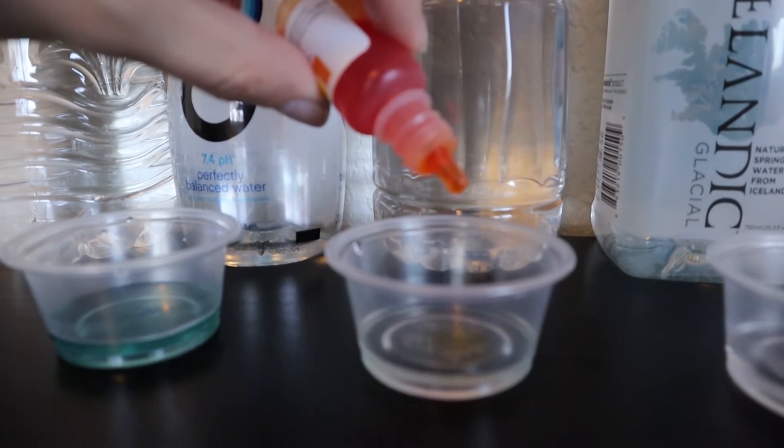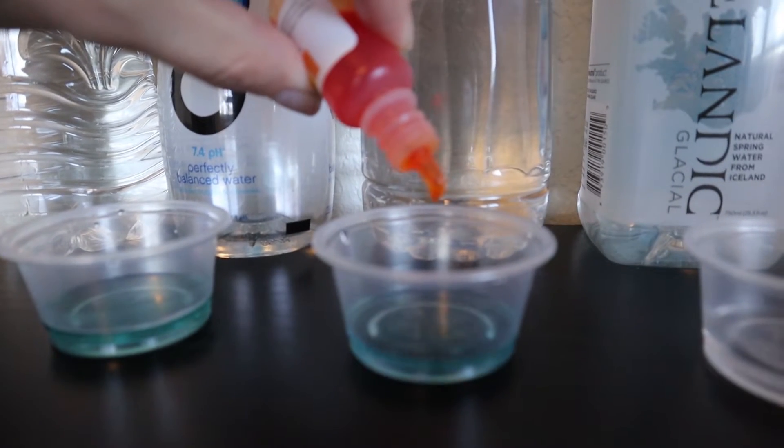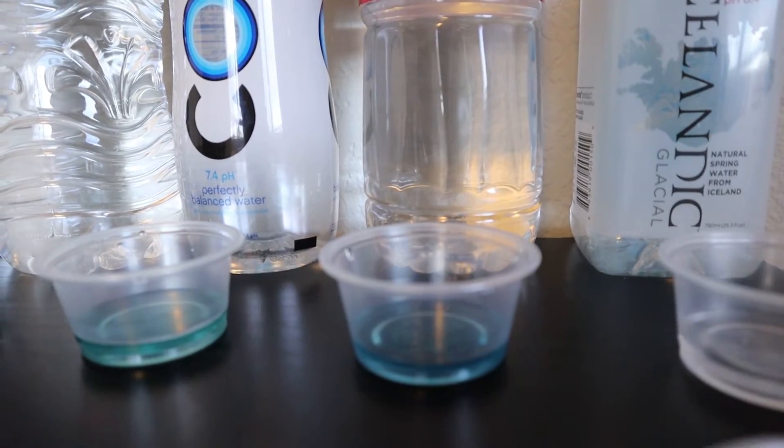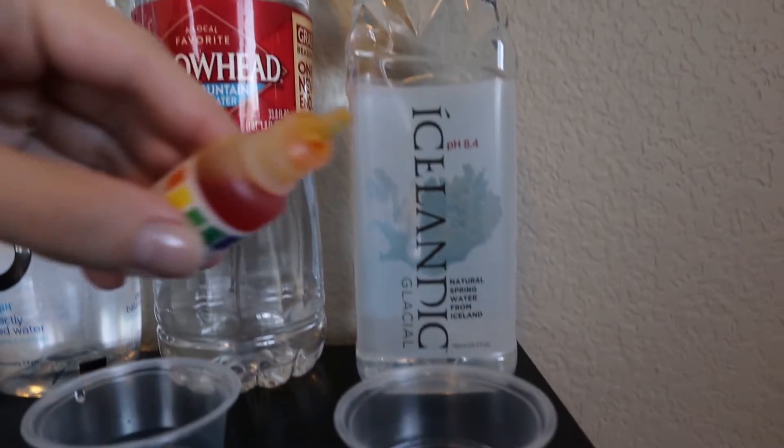Moving on next, we have Arrowhead, which is like Crystal Geyser — it's 100% mountain spring water. We have a very solid blue color, so I'm going to give it an 8.5, close to 9.